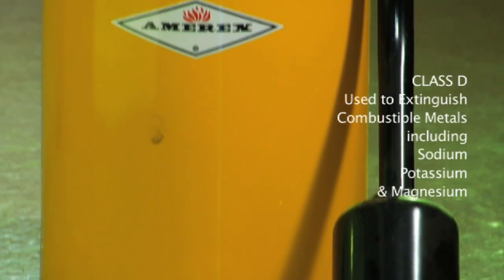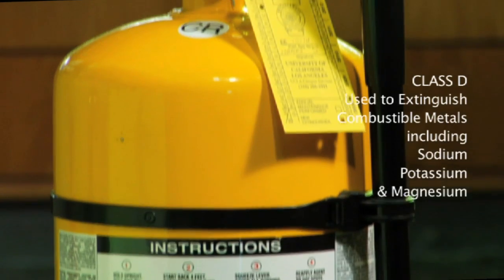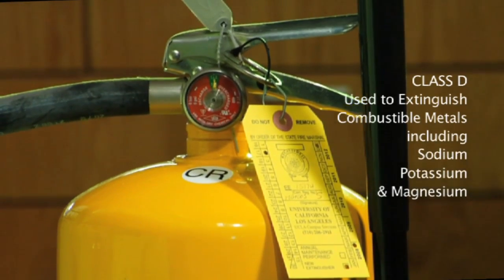Class D fire extinguishers are used to extinguish fires involving combustible metals. Materials in this category include sodium, potassium, and magnesium.